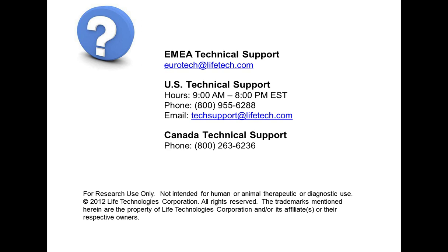So there's a question about the criteria used to select fluorophores with a particular flow cytometer. And this is a really great question. It comes to the heart of what a flow cytometer is, and it's a set of excitation sources, usually lasers, and different collection parameters, which are the bandpasses or the different collection optics. And you really do need to understand what those are for the particular instrument that you're going to use. And then you pair that with the spectral qualities, the excitation and the emission qualities of the dyes that you want to use. And it's a selection process, and this is where Spectraviewer becomes very useful in helping to determine that. So I would say start with your flow cytometer first and find out what the limitations of that system are to allow you to then select the reagents that can be used with that particular cytometer.